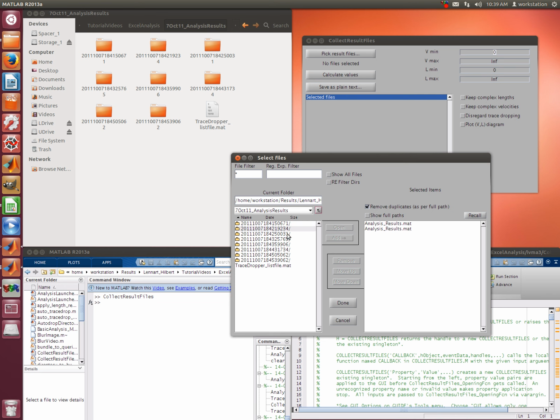The second one. Third. Fourth. Fifth. Number 6.